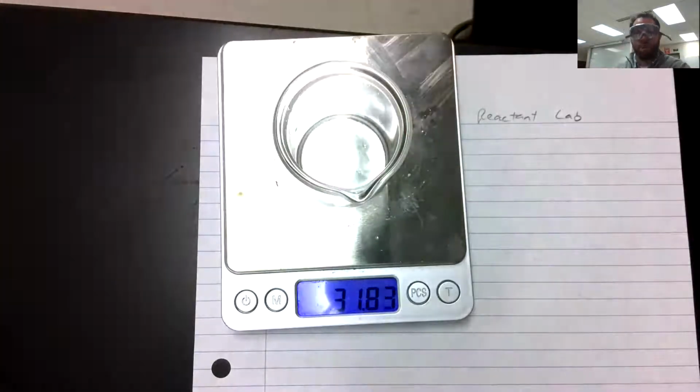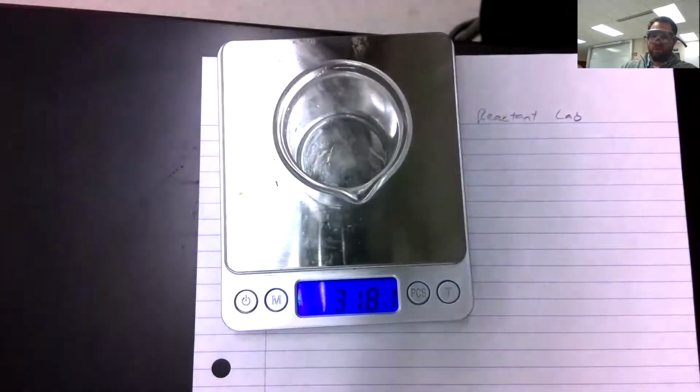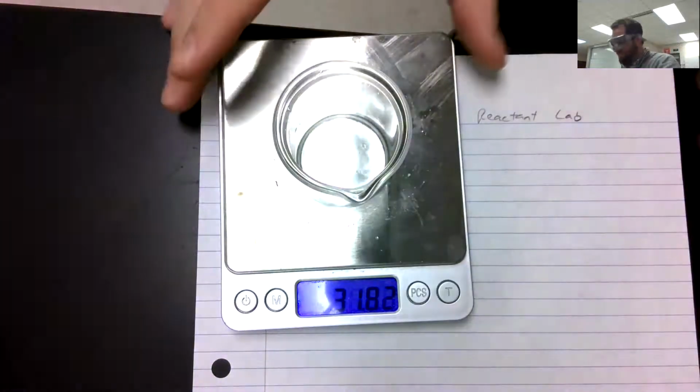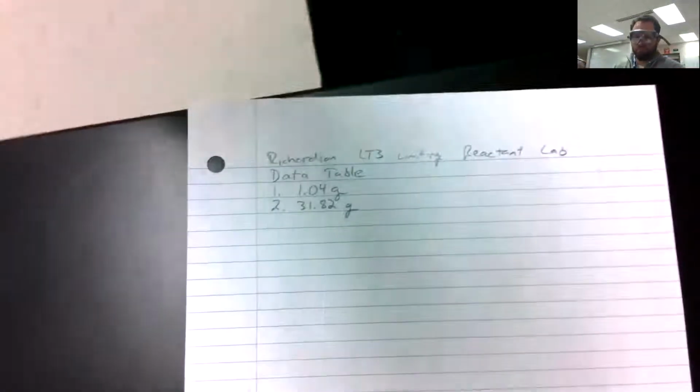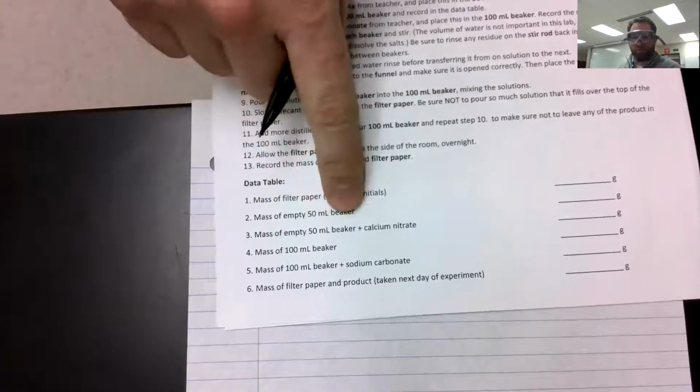Okay, double check, make sure our balance is zeroed out. And there we go. And you guys make sure to record this value. This is our at-home value here. This is 31.82 grams. So data point number 2: 31.82 grams. Again, that is the mass of our empty 50 milliliter beaker.